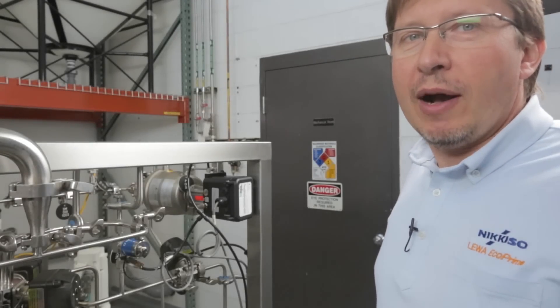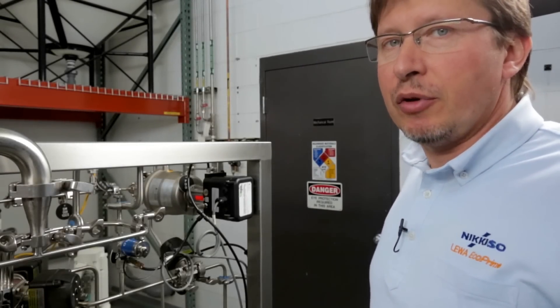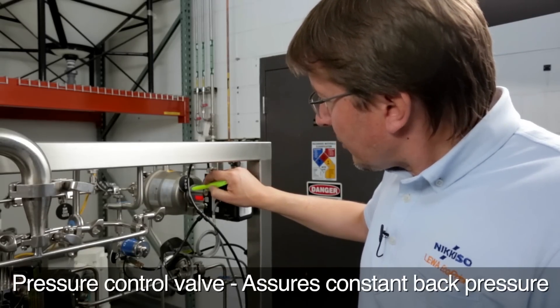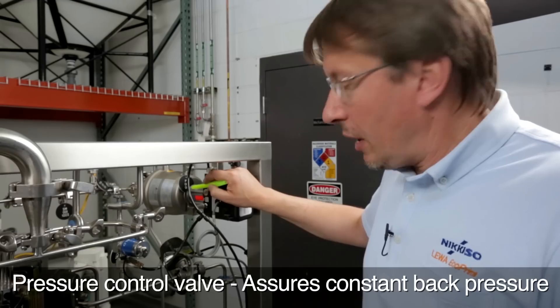Following the fluid flow, I would like to show you the pressure control valve. The pressure control valve is designed to give the pumps a constant back pressure and can be regulated.